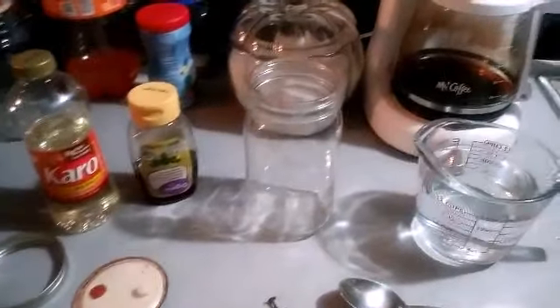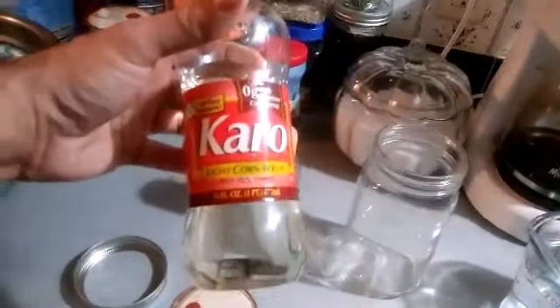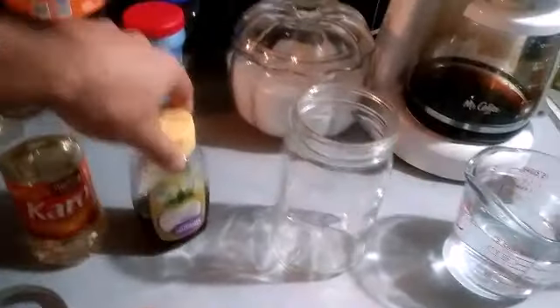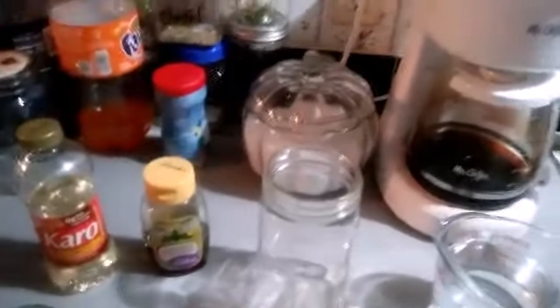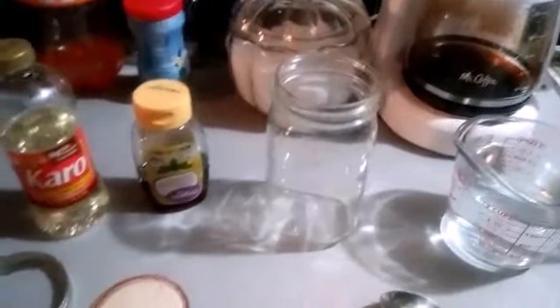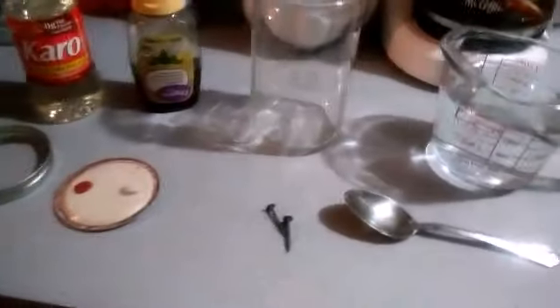So let's do this. Alright guys, for this liquid culture, I'm going to go ahead and go with Karo corn syrup. I mean, you can use honey too. I usually get organic, but I'm going to go ahead and inoculate this jar with some Italian spores. And they seem to do really good in that Karo corn syrup.